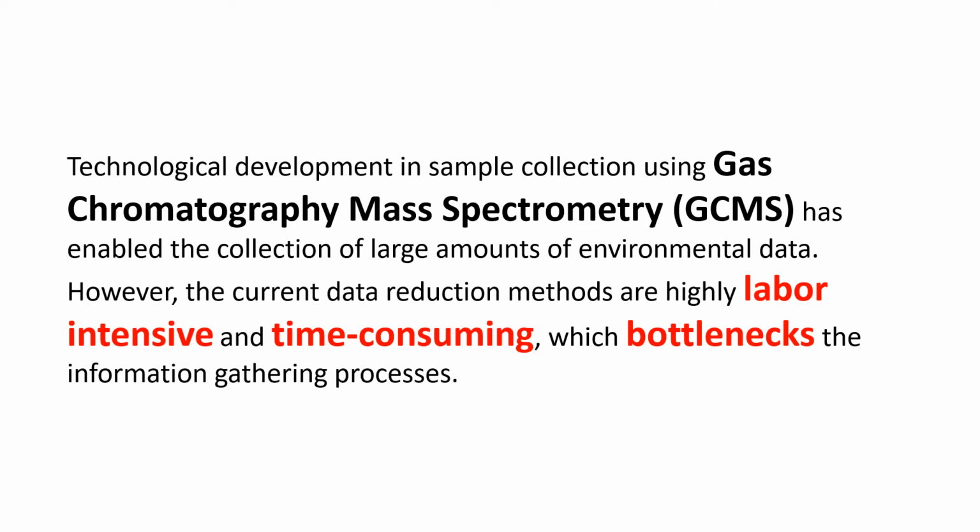Technological development in sample collection using GCMS has enabled the collection of large amounts of environmental data. However, the current data reduction methods are highly labor-intensive and time-consuming, which bottlenecks the information gathering processes.